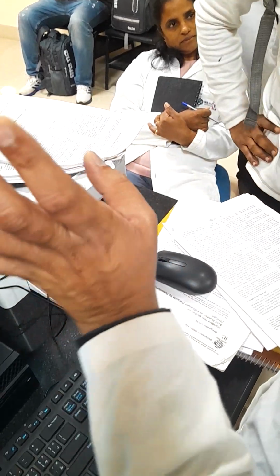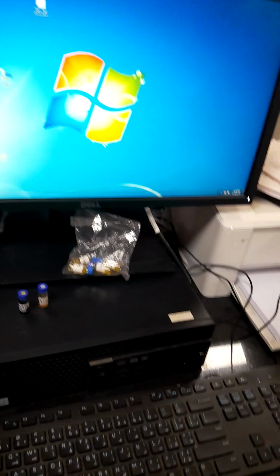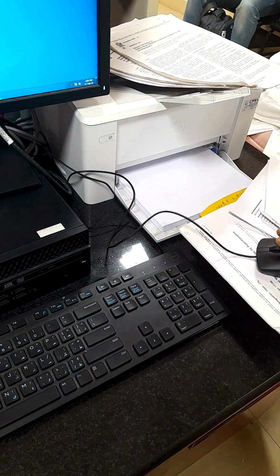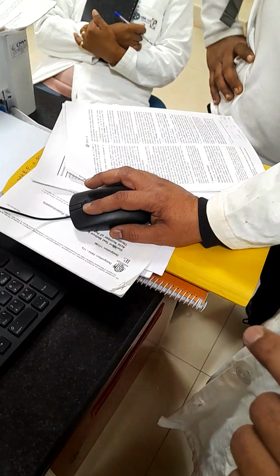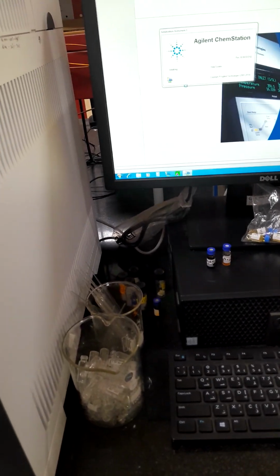But here in the system, from our application point of view, we carry the gas molecules of the evaporated samples along with it. In our case it is also mentioned that the carrier gas is helium and hydrogen can also be used. But here helium is used as per application for this PAC software we are using, that particular software for simulated distillation. You are also correct. With carrier gases, if we use compressed air, then it will corrode.